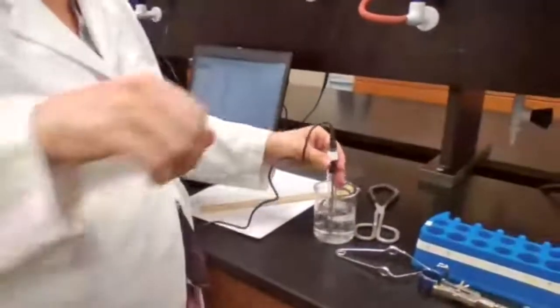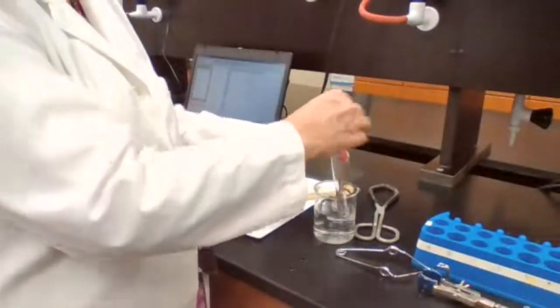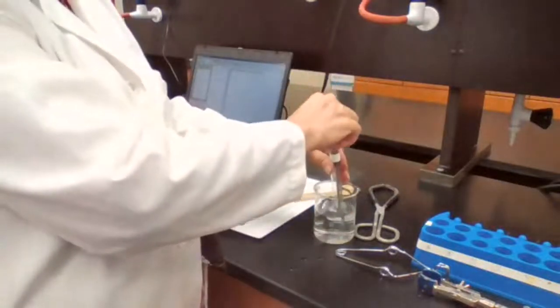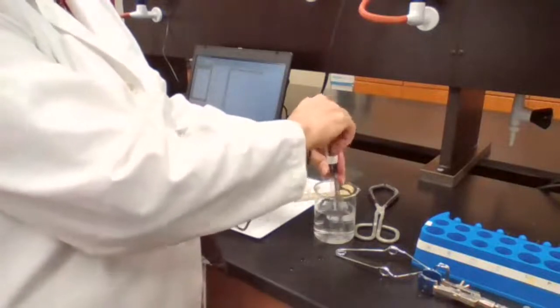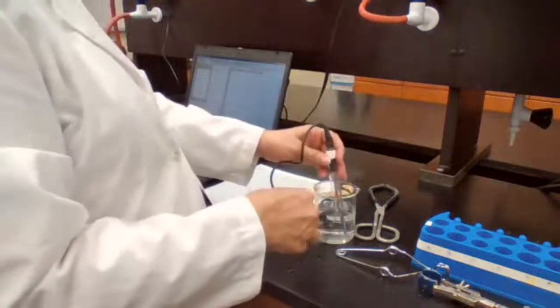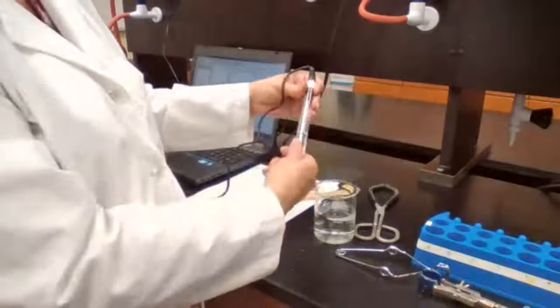Can you put in the cold water just to get it done? It's not part of the procedure, but just to make sure that it's happening. It doesn't take too long because it's really hot in here too, so it's not going to cool off fast enough. I place it in the cold water, and the temperature now is at 43, and I don't see any crystals yet.